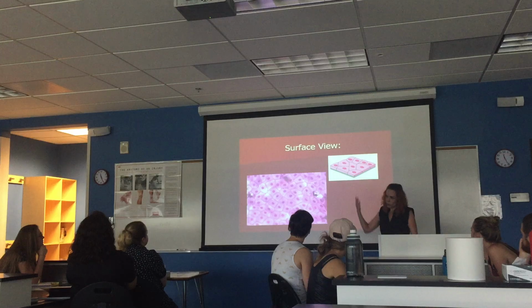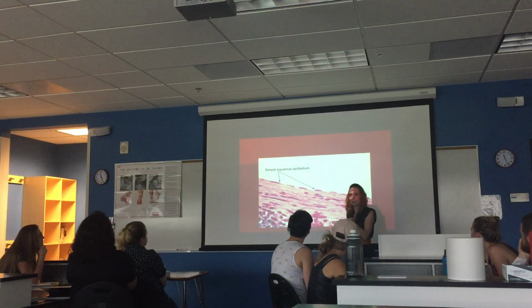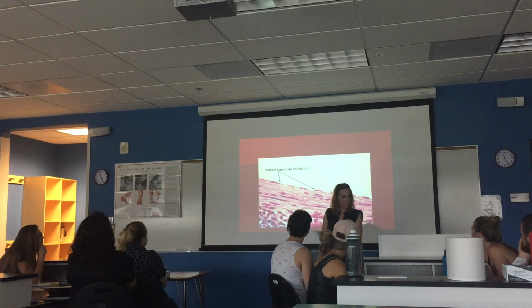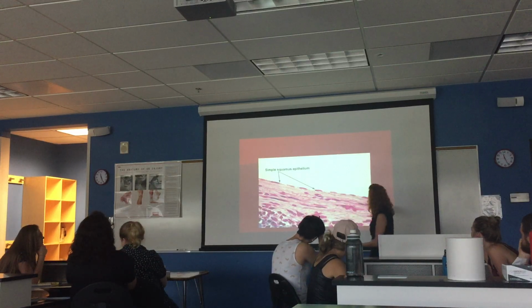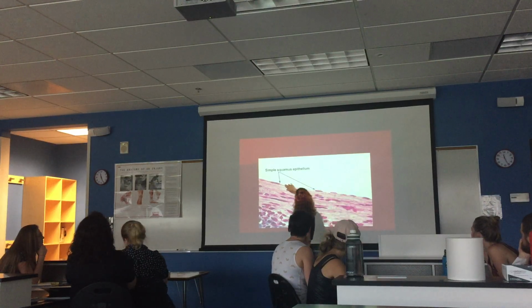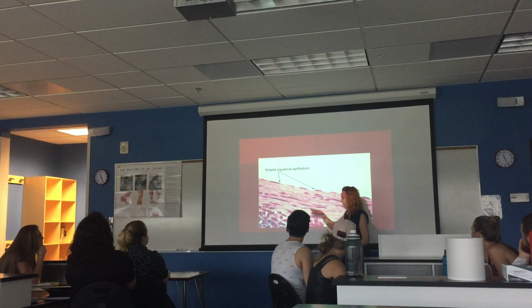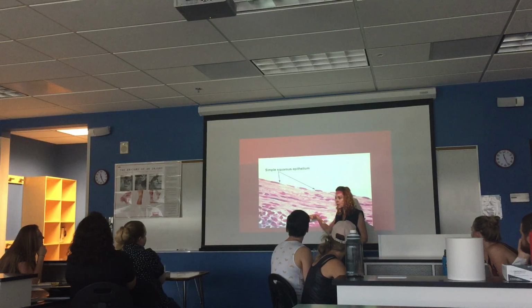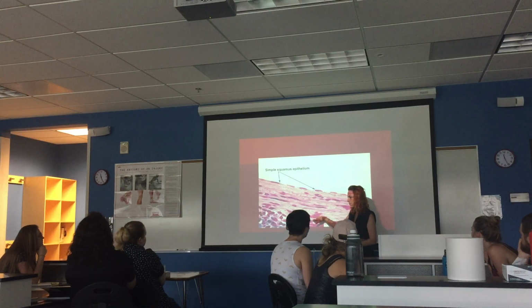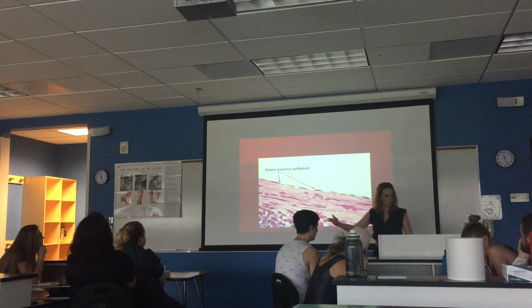But in our slides, we're doing more tissue sectioning, so you don't just have free-floating squamous cells in the body when you slice a tissue like that. So the squamous cells are going to be these little flat, flat, flat cells. You're not so much finding them down here, covering and lining. You can, definitely, if you can find a blood vessel or something like that. But out here is the surface, and that's where your epithelial tissue is going to be.